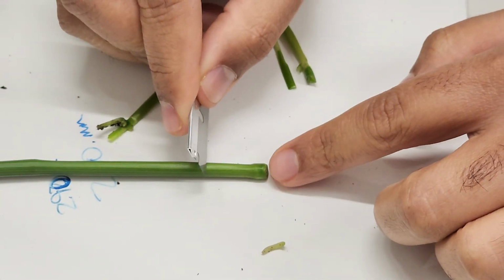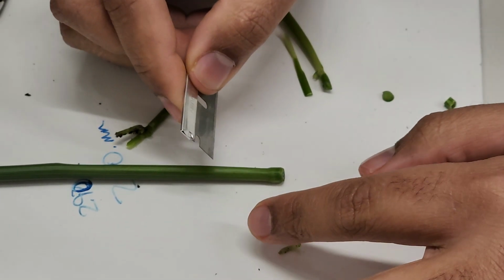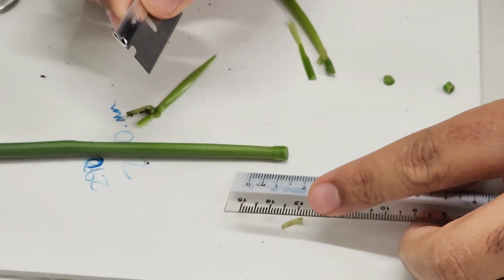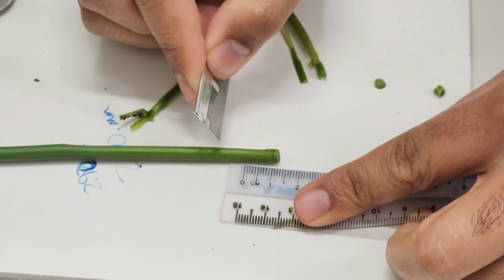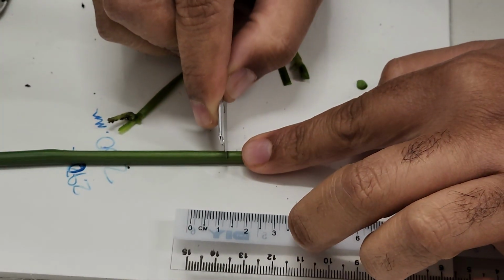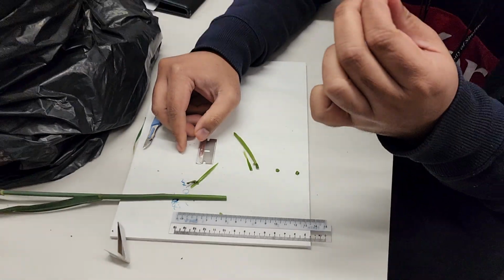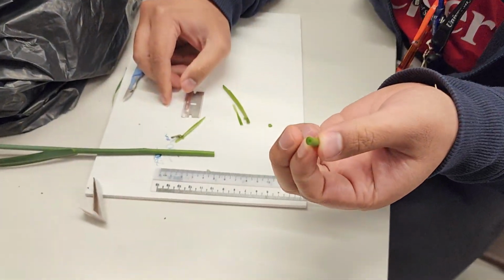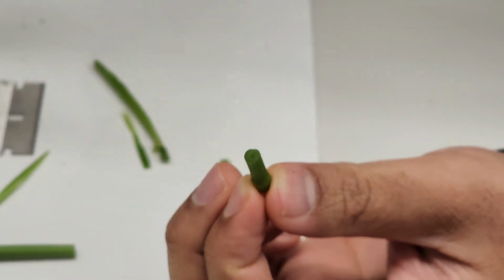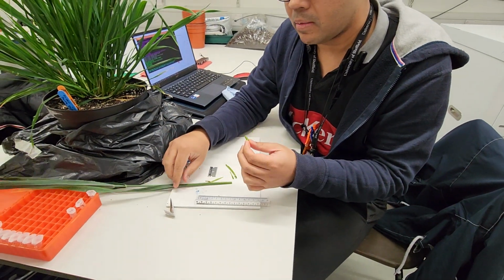Yep. So let's say we take... Do you have a ruler? Yes. Let's take about 1 centimeter or so. Yeah, about that much, 1 centimeter. Yeah. So, any meristem? Can you see any meristem? Yeah. This is a problem with stem elongation. It's hard to identify where the meristem is.